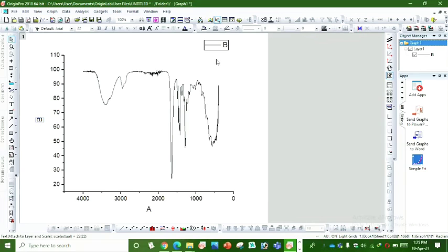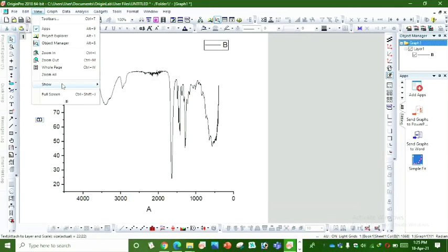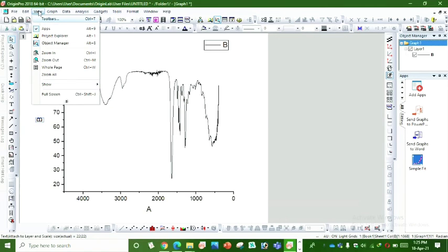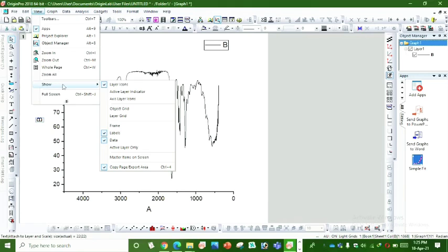We can frame it by moving towards the View File button and then to Show and Frame.